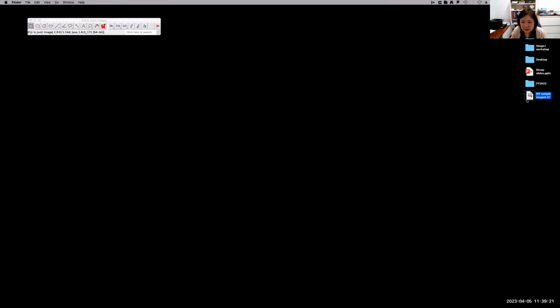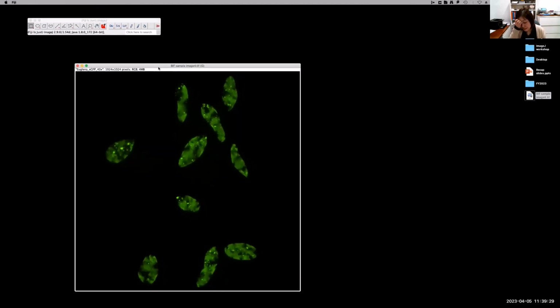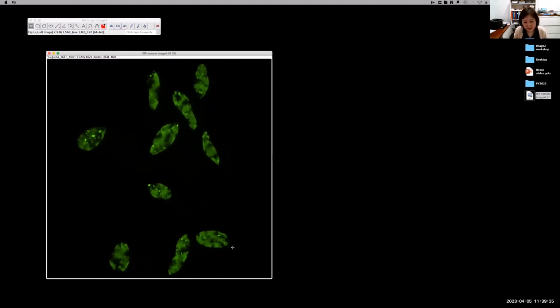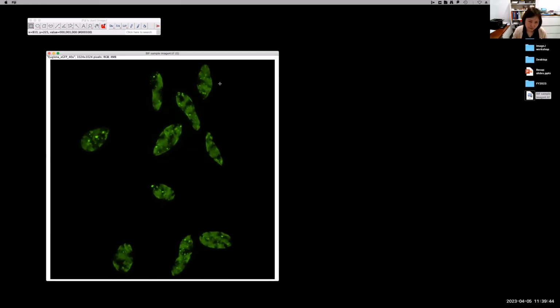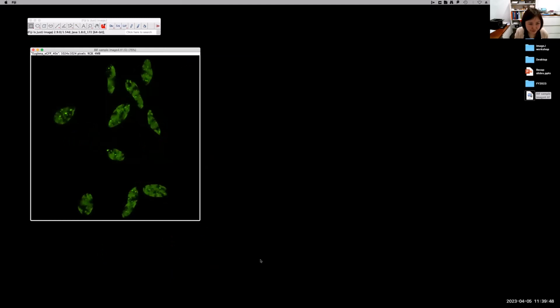I didn't put this sample image because we are talking about cell counting. I thought maybe I can open it. You don't have this image, so you can just watch how I do. Here I have the euglena cells that have the autofluorescence, and let's say I want to do fluorescence intensity measurement, for example.